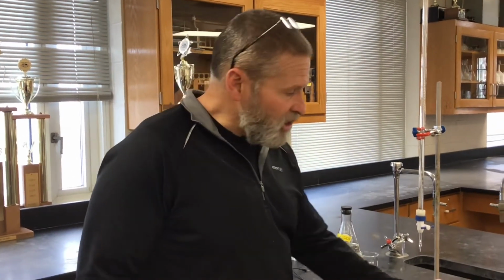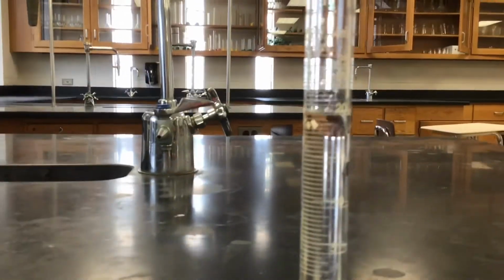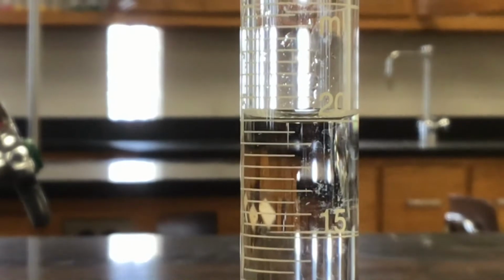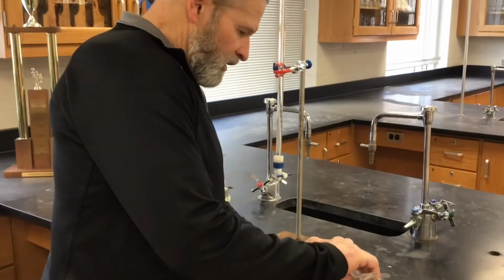Okay, so we've got a strong acid here. Should turn it back this way. Okay, you want to know the volume used. Hopefully it's right at 20 milliliters. Looks like you did a pretty decent job measuring it. Okay. So that's the volume of your strong acid. I'm going to add it to a beaker.